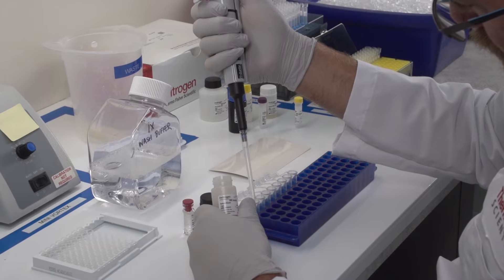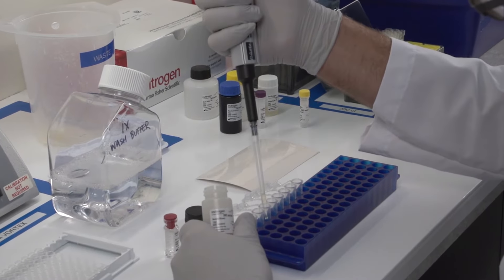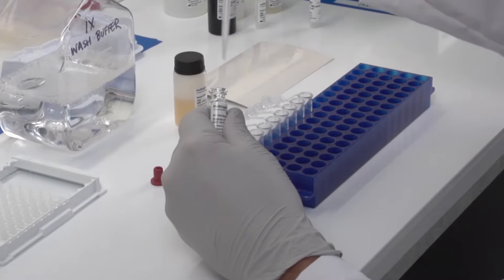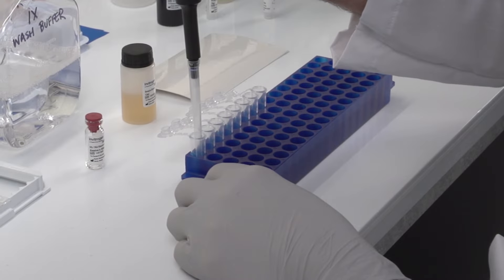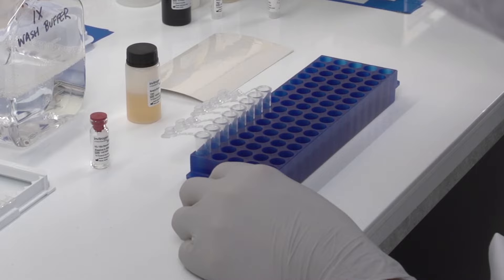Perform a 1 to 2 serial dilution of the standard. Start by adding the appropriate amount of assay diluent into each tube. Then add the appropriate amount of reconstituted protein into the first tube. Mix thoroughly by pipetting up and down and changing pipette tips between tubes.